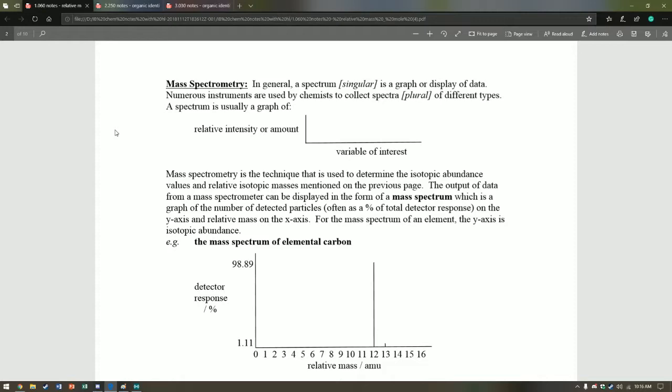Today we're going to be talking about spectroscopic and other tools that you would mainly use in the field of analytical chemistry. We really have three stooges. I'll introduce you to what I call the three stooges here: the mass spectrometer, the proton NMR machine, and the IR spectrometer. So let's first start off with mass spectrometry.